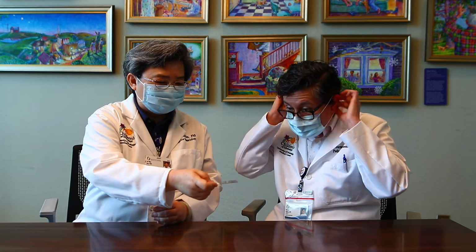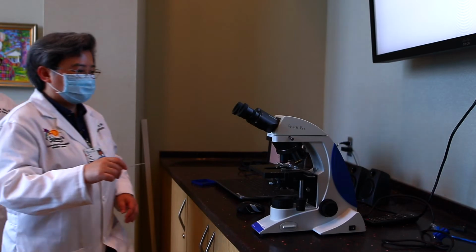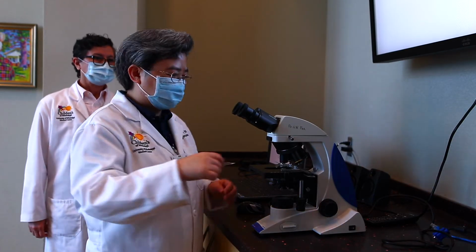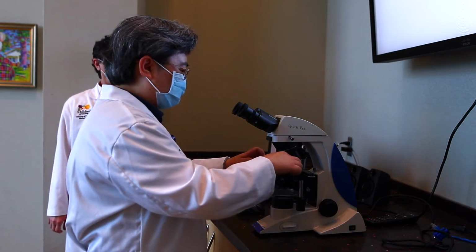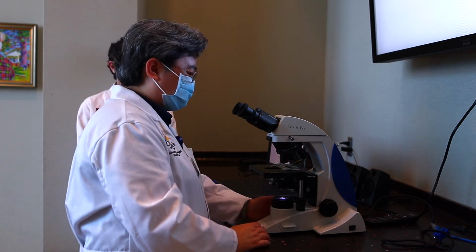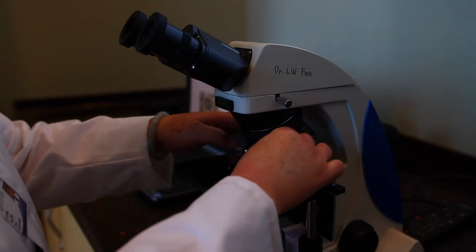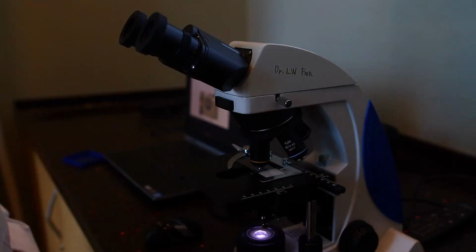Right. So I will be very careful. I wear my mask and I wash my hands and I use the sanitizer before and after this. And let's use the microscope to look at it. Okay. So let's place this glass on the stage. Okay. So that is the stage of the microscope? Yes. And turn on the light and adjust the objective lens to make it bigger.